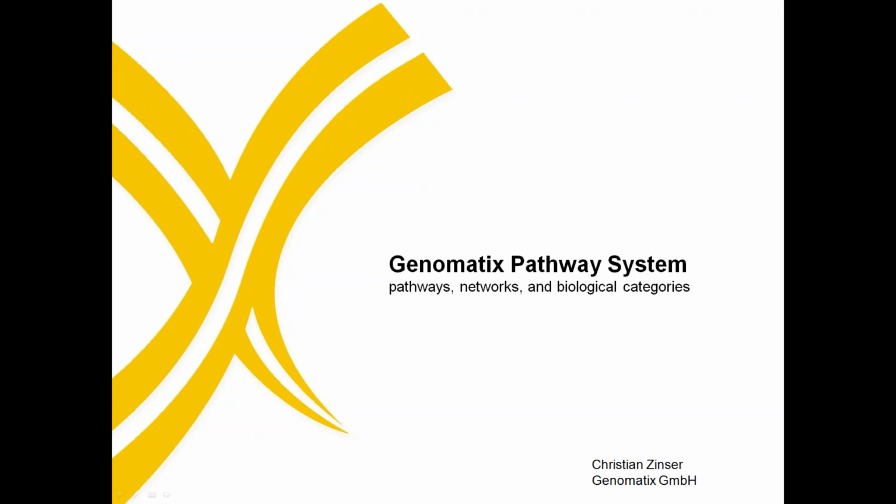All right, so an introduction to the Genomatix Pathway System. I'd like to start with a few introductory slides and then actually go into a demonstration of a lot of different features of the pathway system.